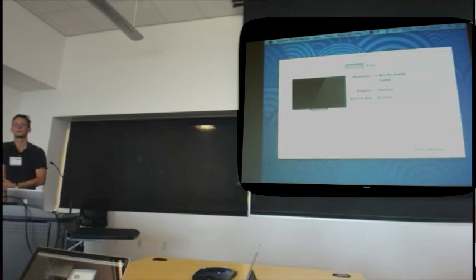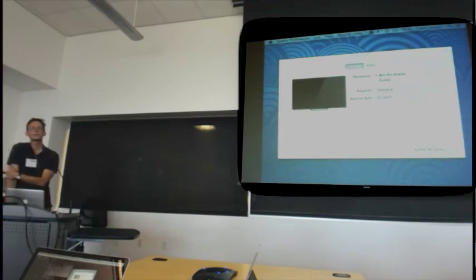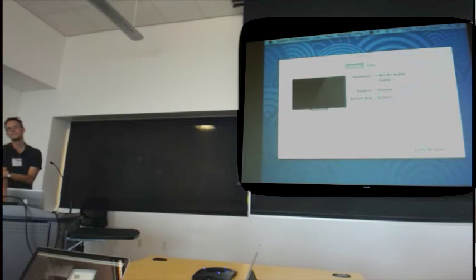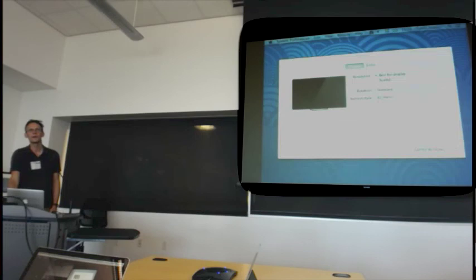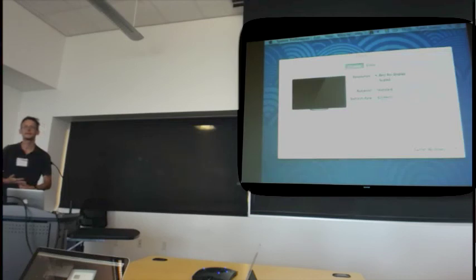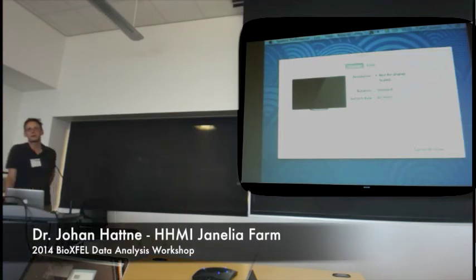Is the data obtained sufficient to determine novel structures? This is something we're actively working on at the moment. We've made some progress, but there's nothing published on that yet. But it's something we're very actively looking into. Probably, yes. But until it's actually done and squared away, I shouldn't really promise anything. I think also, since we're working with electrons, that gives us some completely different ways of phasing.